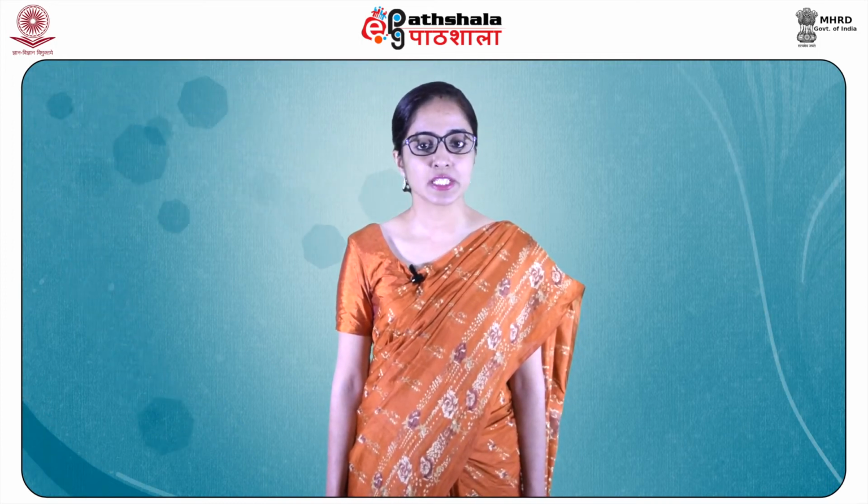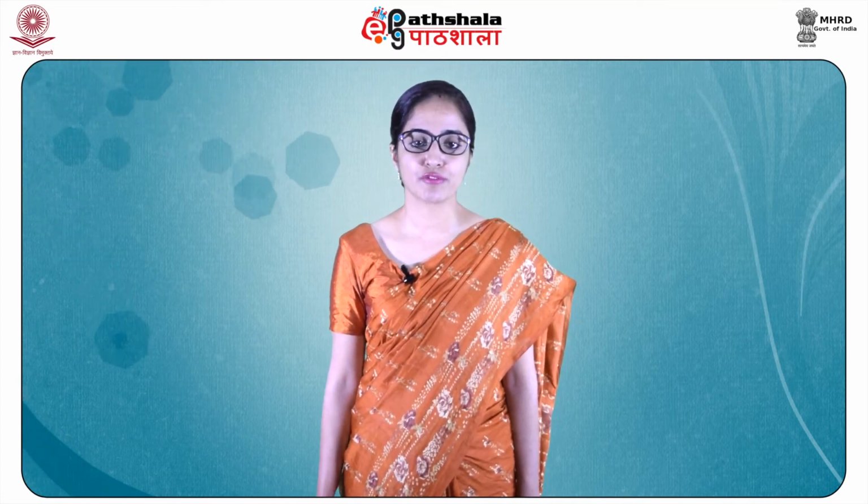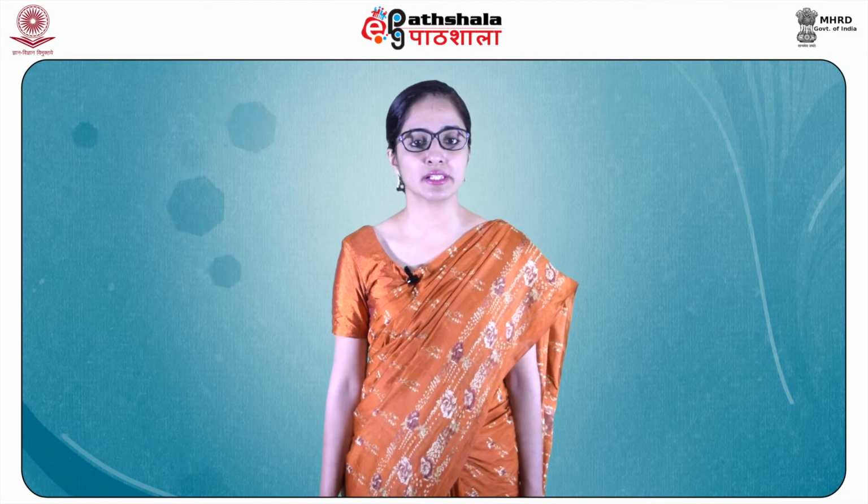Second is matrix assisted laser desorption ionization, popularly called MALDI. Secondary ion mass spectrometry, also short-formed as SIMS, is the third category of desorption ionization techniques.